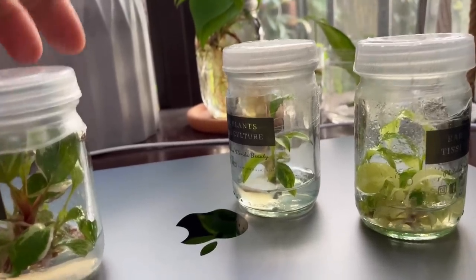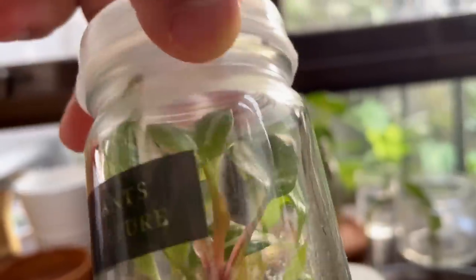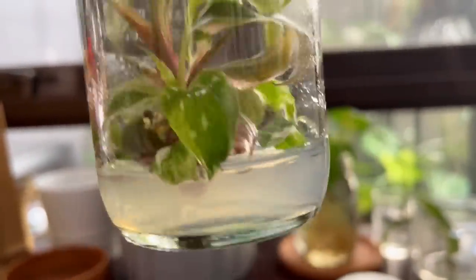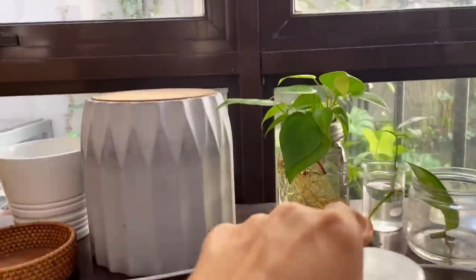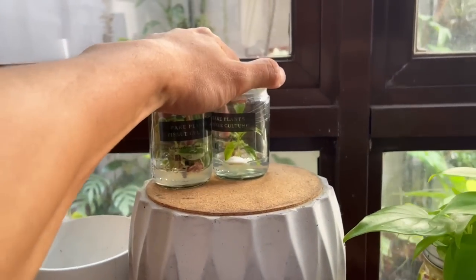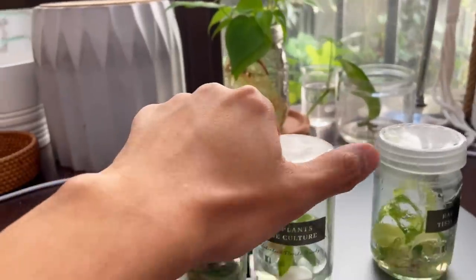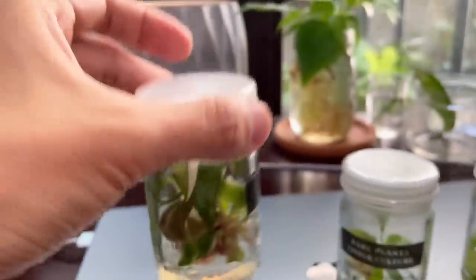Here is a six-week update on the plants. This one — the Pink Princess — has grown quite a lot. I can see the leaf is almost hitting the top of the jar, but there's still some fluid here providing it food, so I'm going to leave this alone for now. It's been getting medium to low light here because I don't have very bright light. There's usually air conditioning on in the daytime so it's not super hot. I see many, many branches and vines that have appeared. This one here is the Philodendron giganteum variegata — it's also grown in size quite a bit and looks really healthy.